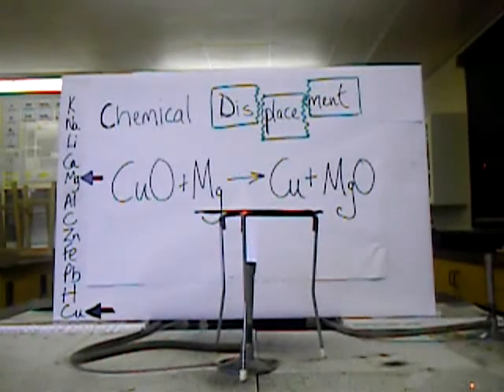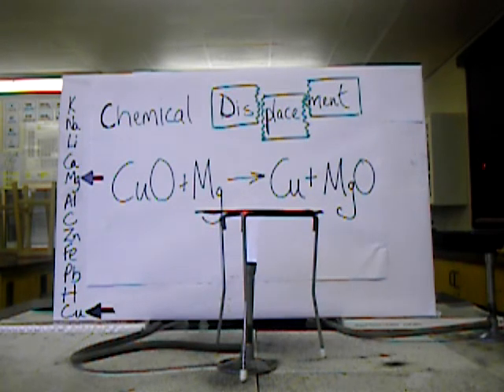There you see lots of smoke created in a highly exothermic reaction. The displacement of copper from copper oxide by the more reactive metal, magnesium. Thank you.